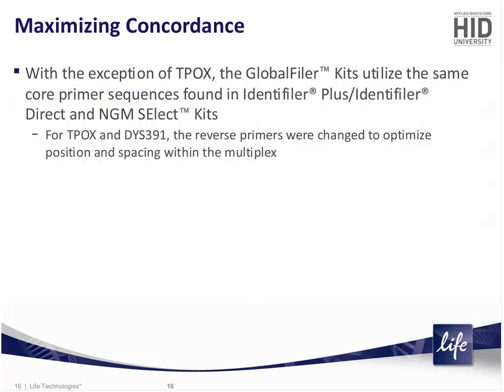Keeping our primer sequences the same has always been at the core of our design decisions, mainly because we want to maximize concordance. Now again, there's always a lot of discussion around how big an issue concordance is, and with small databases and small data sets, concordance is not generally a very large issue. But as international databases continue to grow and the number of samples on those databases continues to increase, the risk of non-concordance actually also increases. And so for us, we believe that in the long term, we will minimize any issues with interpretation for the laboratory by ensuring that we keep our primer sequences as consistent as possible.